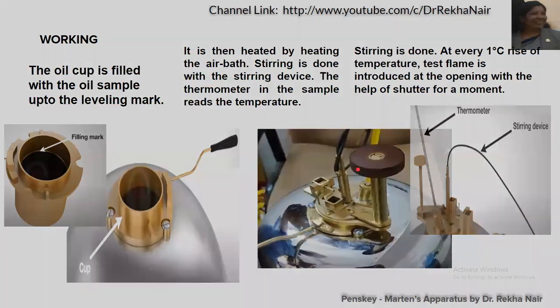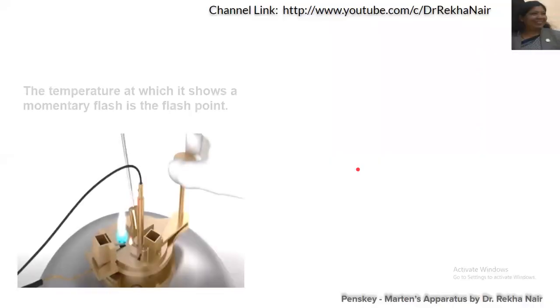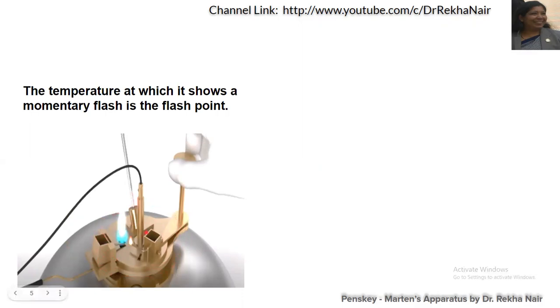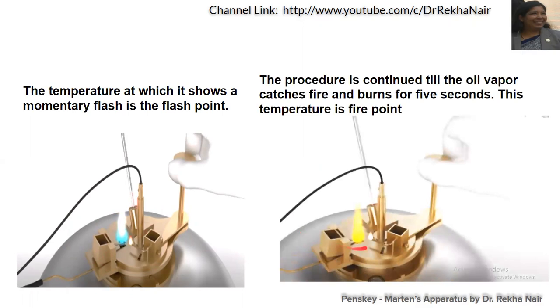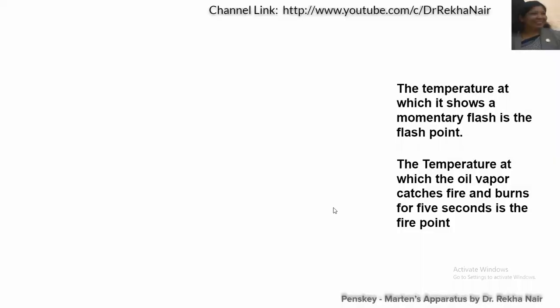This is the shutter. The temperature at which it shows a momentary flash is called the flashpoint, and the procedure will be continued till the oil vapor catches fire and burns for about five seconds. The minimum temperature at which the oil continuously burns for five seconds is called the firepoint.